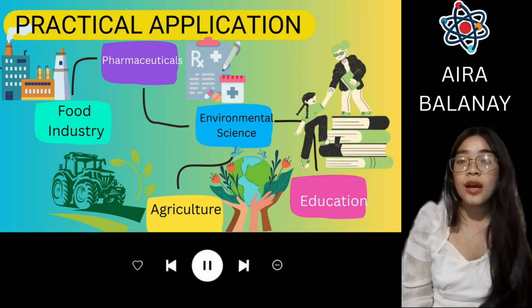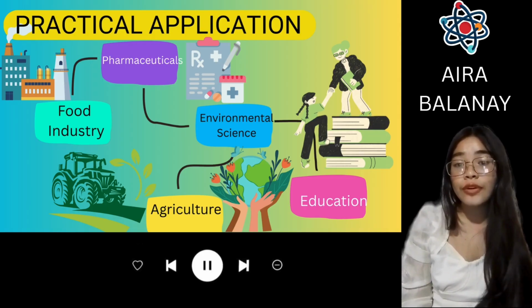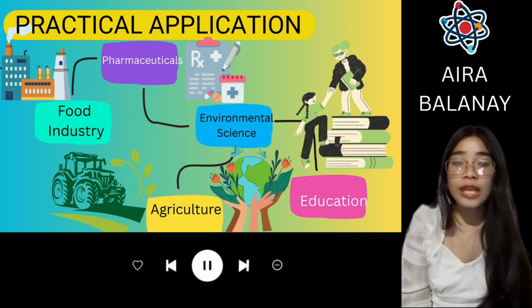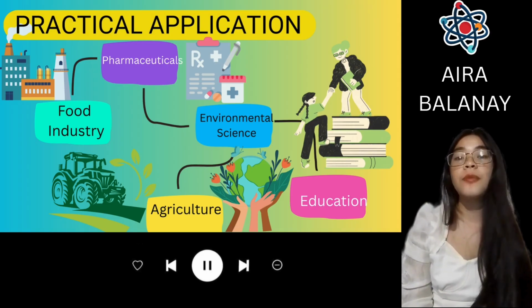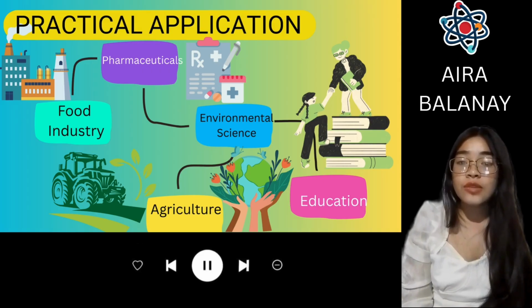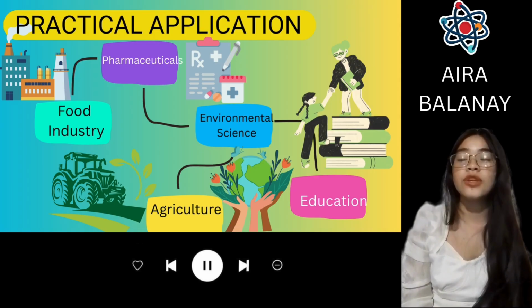For example, in fruit juice production, titrimetric methods can determine the concentration of citric acid. Citric acid is a key component impacting the juice's taste and its preservation. This ensures the juice meets the quality standard for both flavor and shelf life. Titration can measure the amount of added ascorbic acid, which is vitamin C, verifying the nutritional claims on the product label. Measuring the total acidity also helps assess the potential for microbial growth, directly relating to the safety of the product.